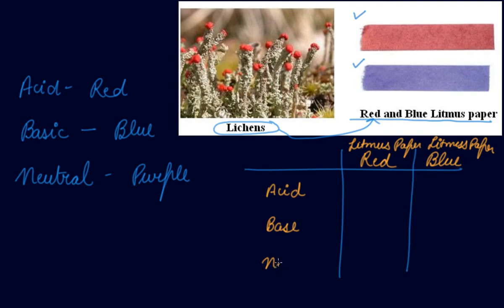When testing an acidic solution, if your red litmus paper stays red, it is acidic. Your blue litmus paper turns red, which also confirms it is acidic.